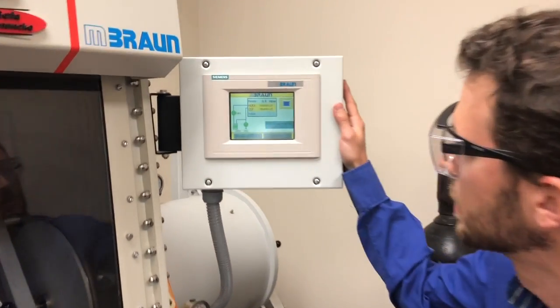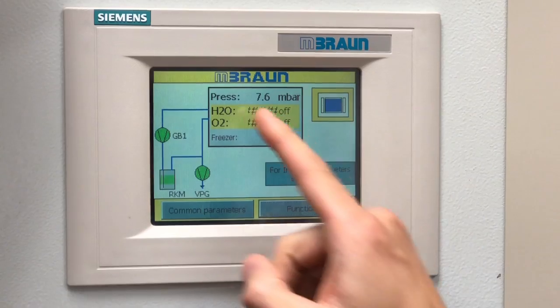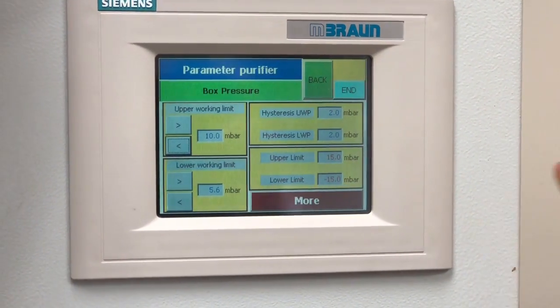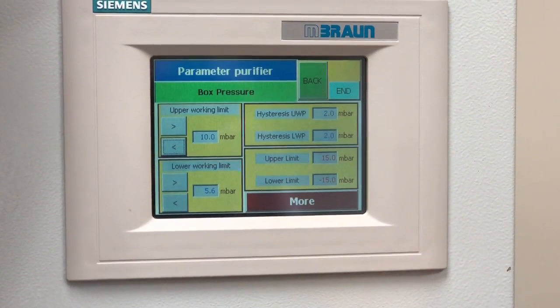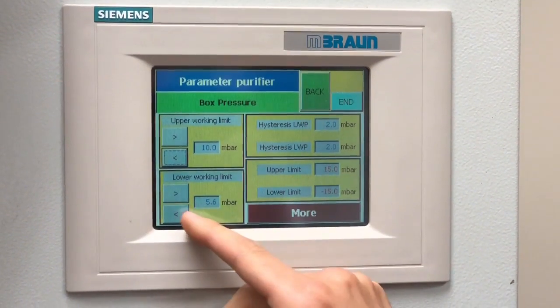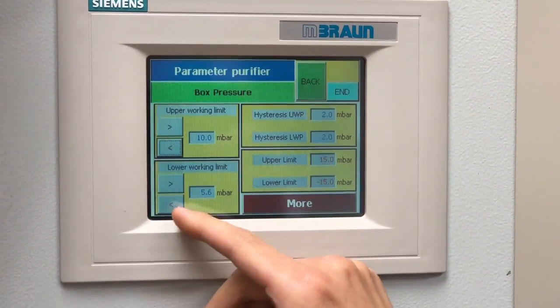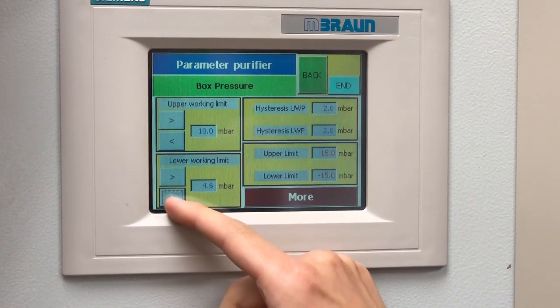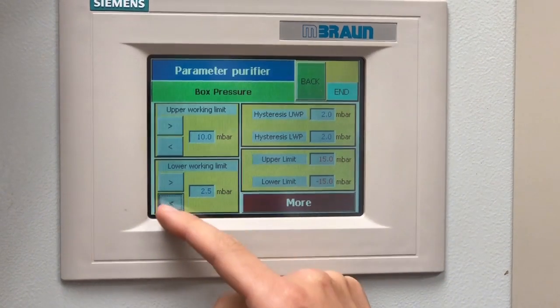While this is filling, you can focus on the touch pad. The first thing you want to do is press 'Press', which allows you to change the working pressures. We'll always keep the upper working limit at 10 and the lower one around 5 if it's idle. But if we want to work, we can lower this to 0.5.